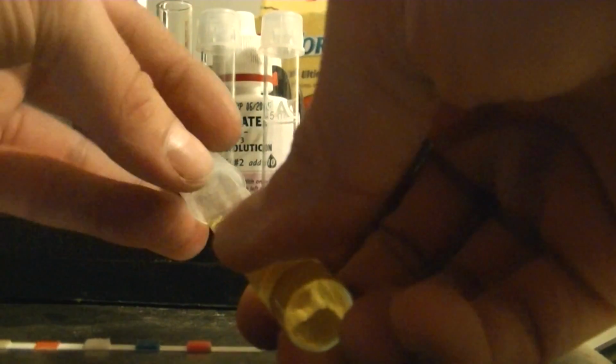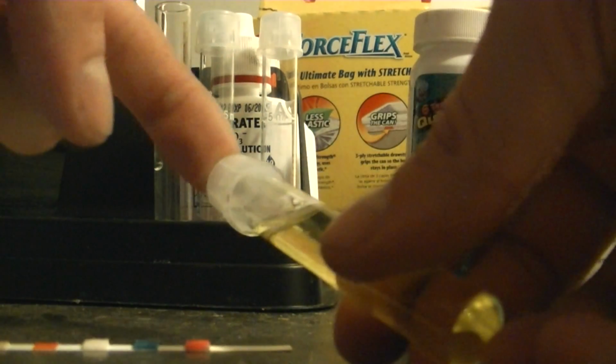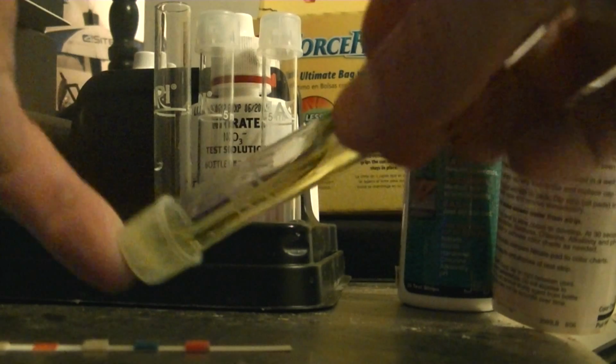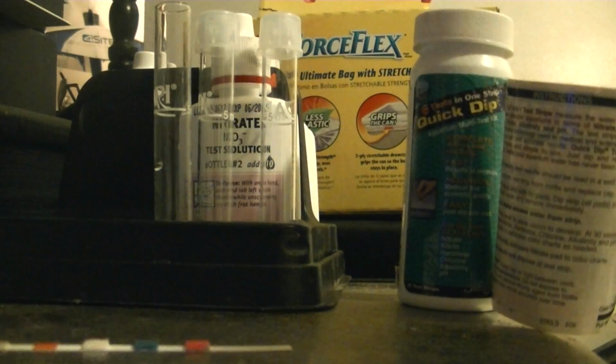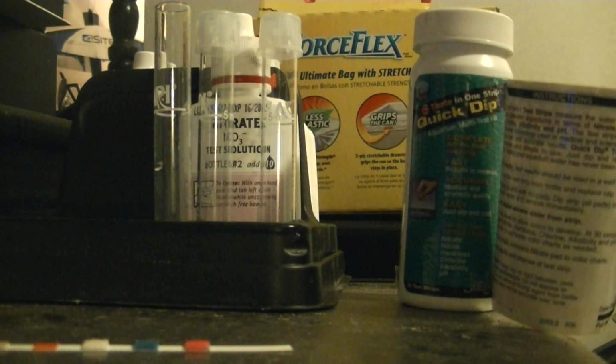Now I'm going to close it with a cap. Don't use your finger, use the caps they include. Your finger could mess up the test. Swish it around a little bit and then shake it for a little while. It says up to 30 seconds in the instructions.